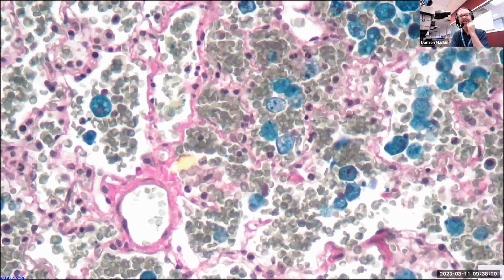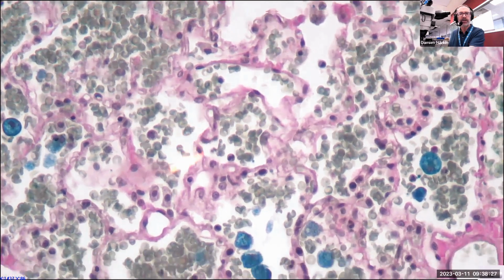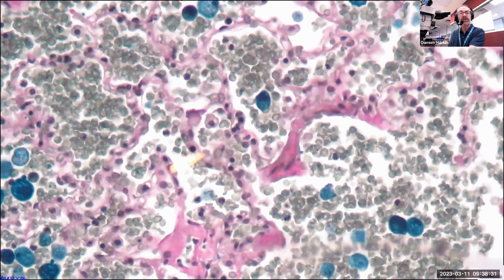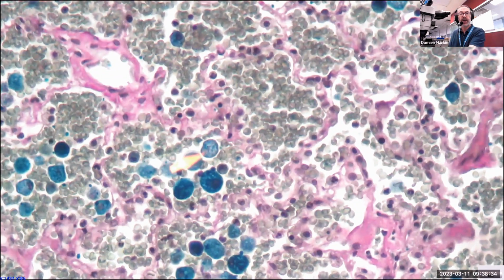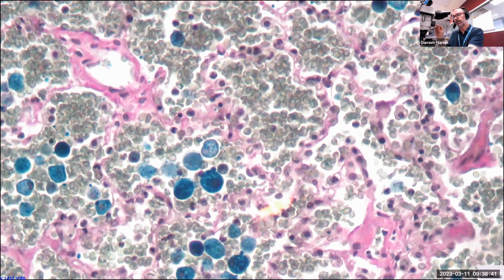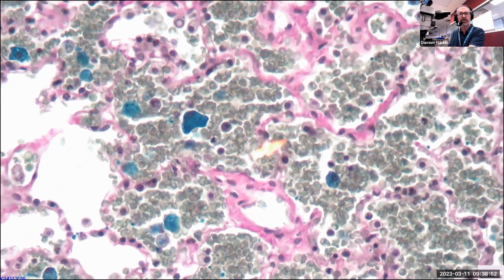So does it work? I think it actually still works pretty well. I don't know whether you would want to bother doing it, but in many respects, because we can see nuclear detail very strongly, this may be a preference rather than the other combination that I just showed you, where we haven't employed a nuclear stain. Well, there might have been some nuclear fast red, yeah. So I think the Weigert's hematoxylin certainly stands out much more strongly there.